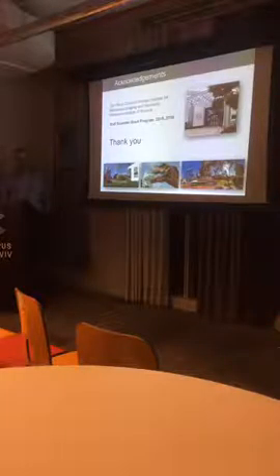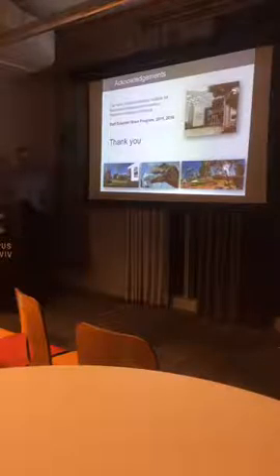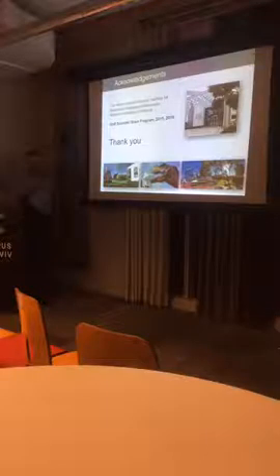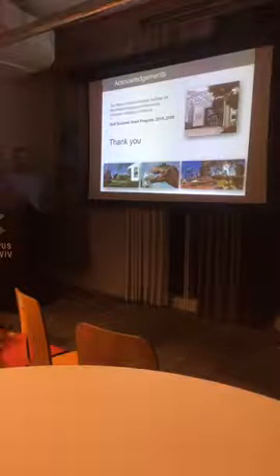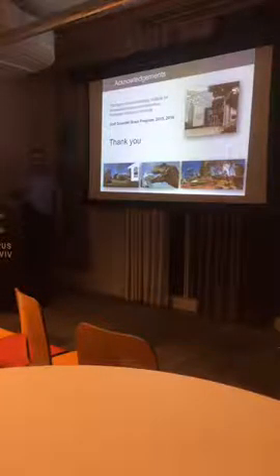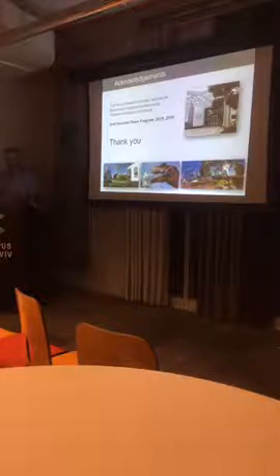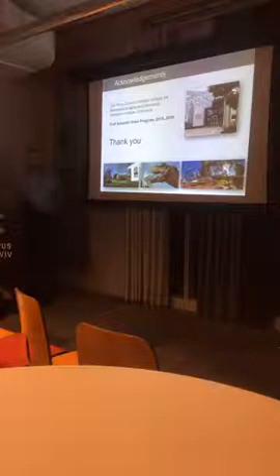And with 4 millimeter thickness, okay, what is the intensity you can get? Thickness, we solve it by using infrared dye. And with infrared dye, then we use, I showed you the sun. So actually now we more and more introduce more complicated computation in order to get information and do phase retrieval. But this is our next, it's not for this talk. It's much more interesting afterwards.